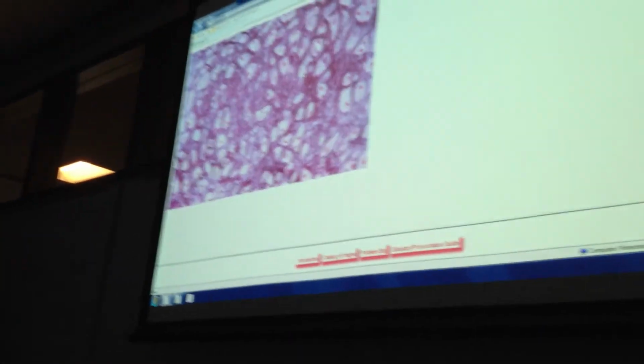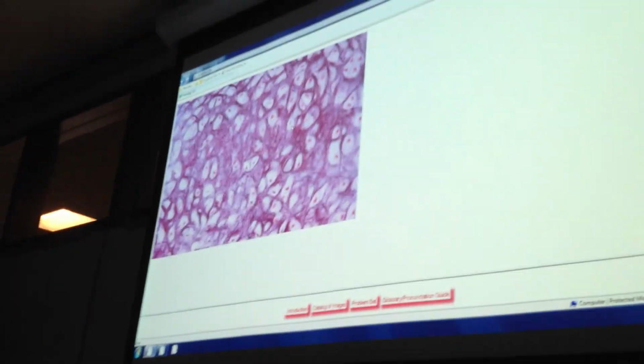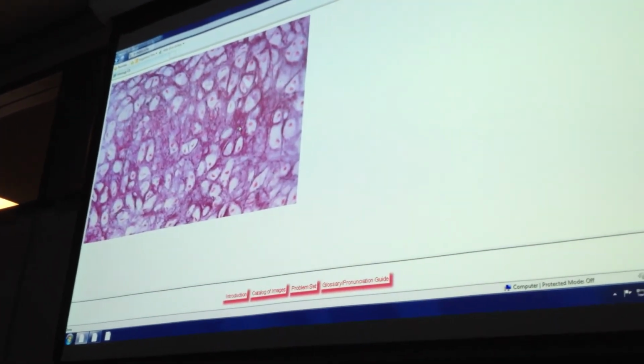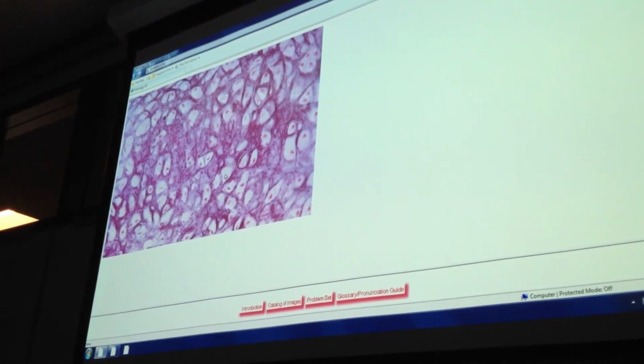Remember, you found it where? Ears, epiglottis, tip of the nose. Okay, how do you know it's elastic cartilage? You've got those black fibers. You can see the lacuna.